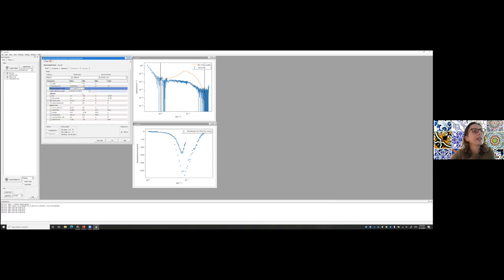And the radius effective, so basically the radius effective is the radius that the structure factor sees. So it's kind of an average of this polar and equatorial ratios, if you want. And we're going to set that to unconstrained so that we can vary them freely. Otherwise, it sets specific relationships between polar and equatorial radius, and we may not be able to change this too much. Okay, so we set that. Radius effective, it's now set to 20.